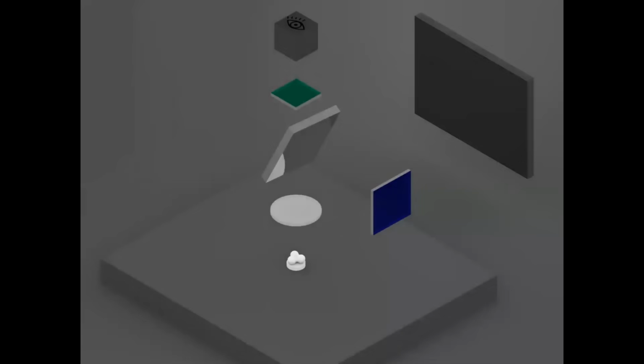The first filter is used to select a distinct wavelength for excitation of one of your fluorophores in your sample, here blue light. The dichroic mirror reflects the light onto your sample, from which emission light will be transmitted back. This light, here green light, will now be able to pass through the mirror, and then will go through the second filter to select a specific emission wavelength coming from your excited fluorophore, blocking all other unwanted light. This filtered light will then reach the detector, where it is translated into an image. You can do this for each fluorophore and are left with an image containing all 3 fluorophores, together yet separated.